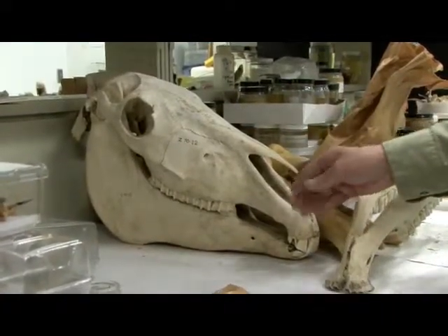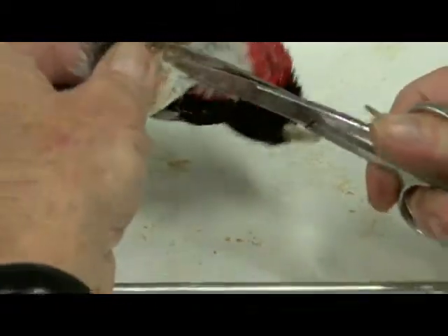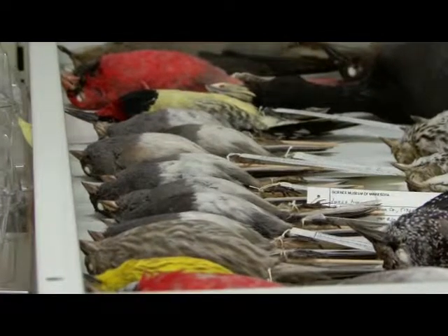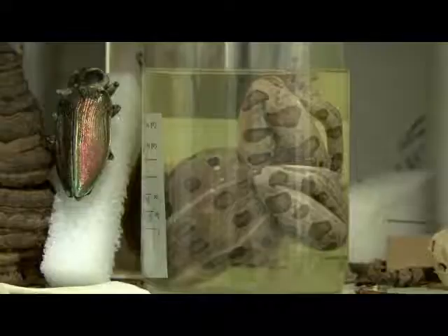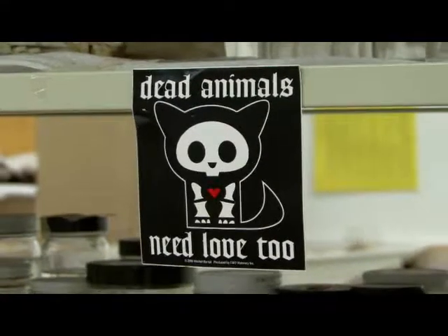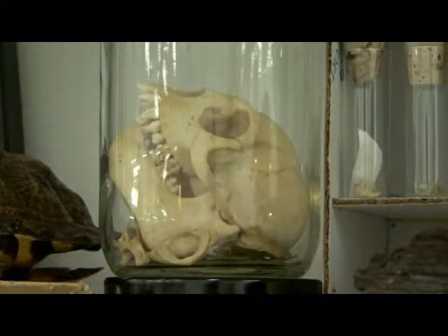This lab involves a lot of biological processing, and what I'm doing is saving a lot of specimens for biological study in the future. We may use them for exhibits, we may use them for educational programs, we may use them for research. We have a tremendous variety of birds and mammals and reptiles, amphibians, and we have skeletal materials processed from some of them. We have some that are exotic animals that are no longer found in the wild, some zoo animals.